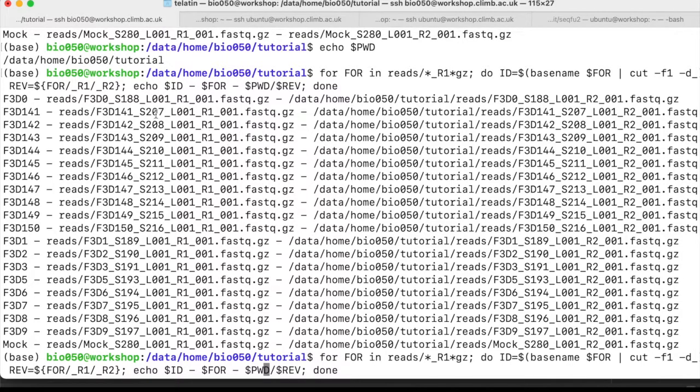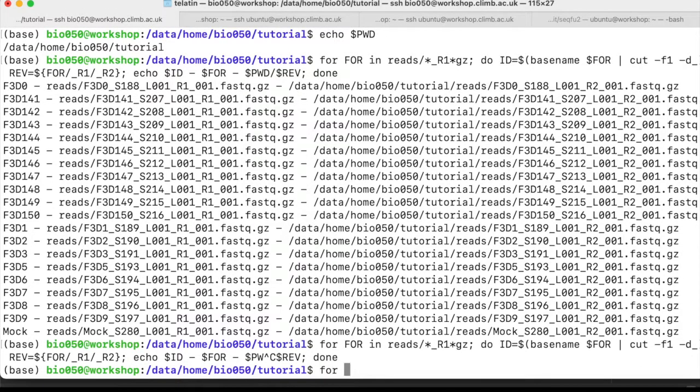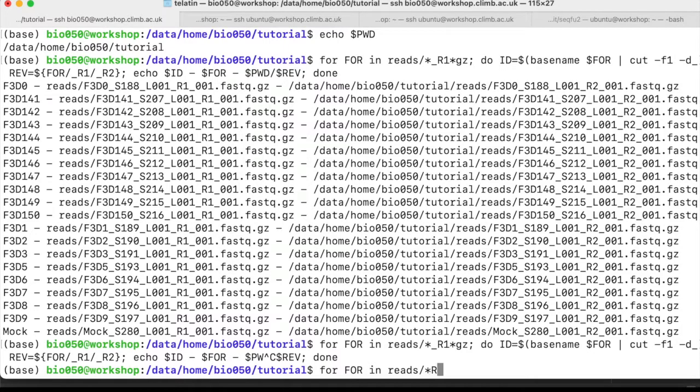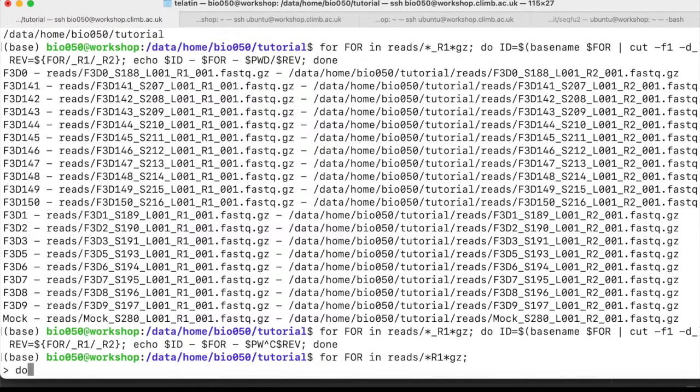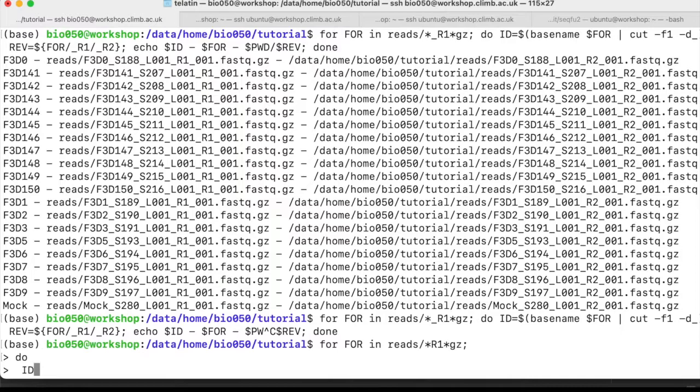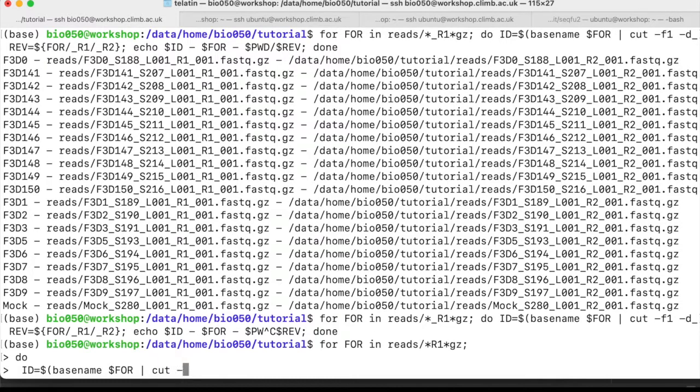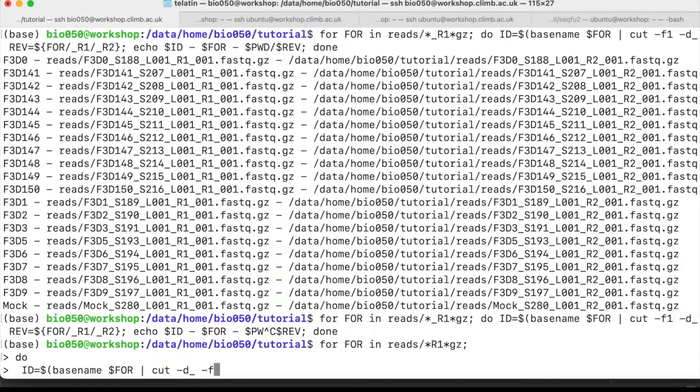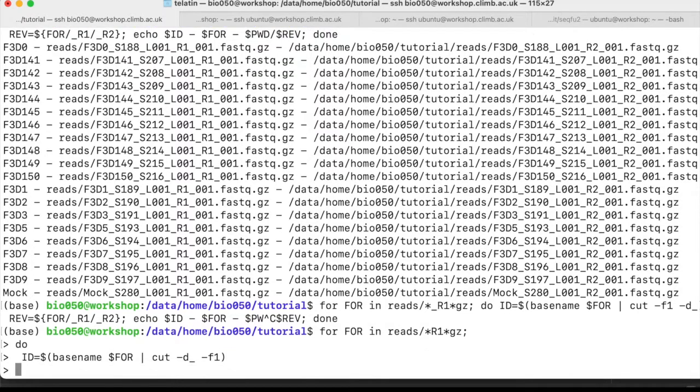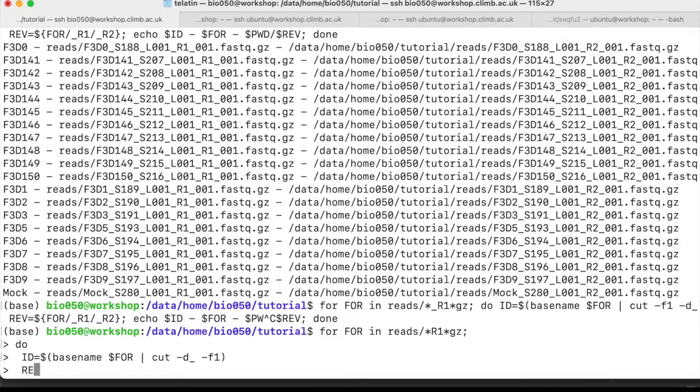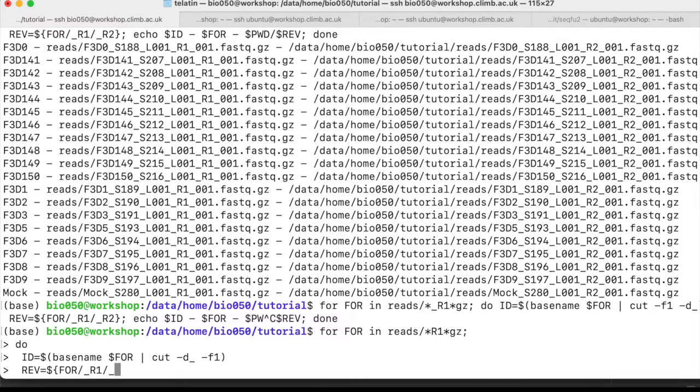So to start from scratch, I can do for loop, then I create a new variable with the basename of my forward read, and I will split the string on the underscore, so -d for delimiter underscore, and -f for field, the first field. I don't need the semicolon, because I add new lines. Then the reverse file would be the forward variable where you replace, and this is the syntax with the slashes to replace a string in a variable, r1 with r2.